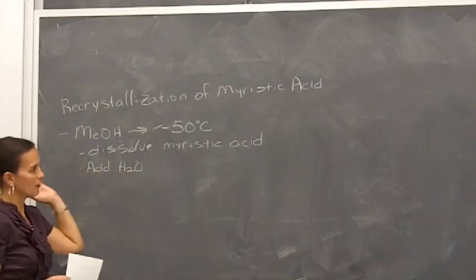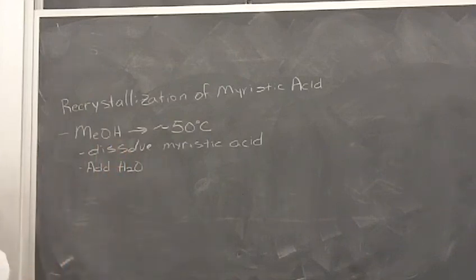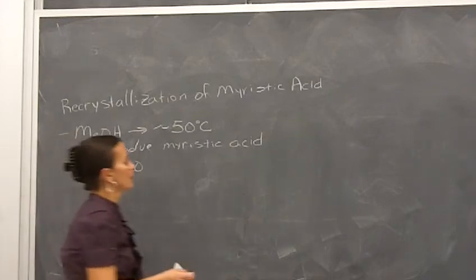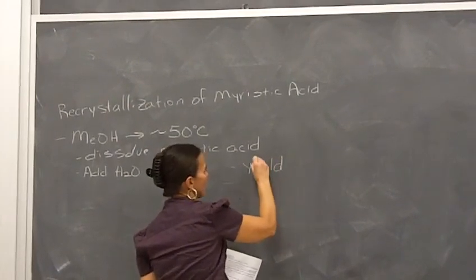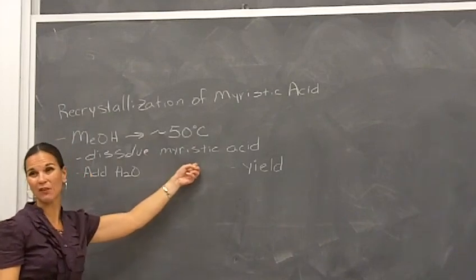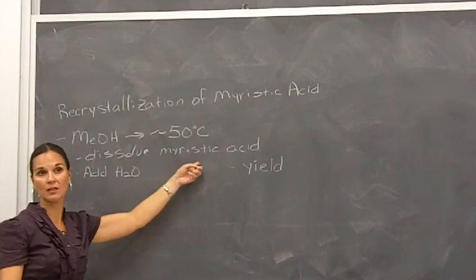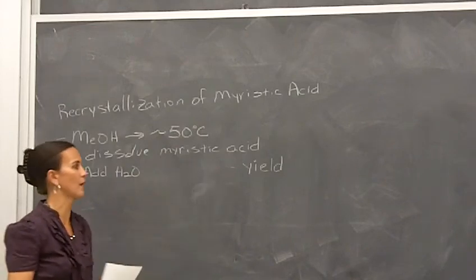And then you'll continue on with the recrystallization, let things cool slowly to room temperature, and then again isolate the solid with vacuum filtration, okay? So then you'll have your purified myristic acid. For the myristic acid, you also need to make sure you get a yield, which will need to happen after this has dried, okay? So probably at the end of lab this week, it will not be ready. You may need to come to open lab to get the yield there, all right?